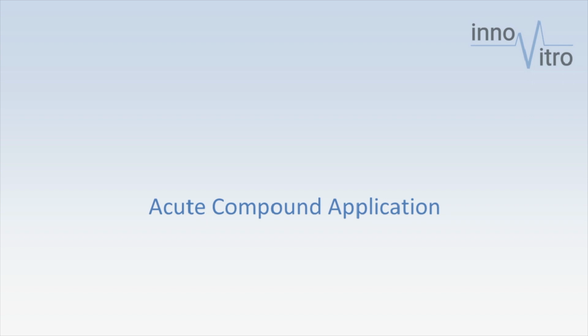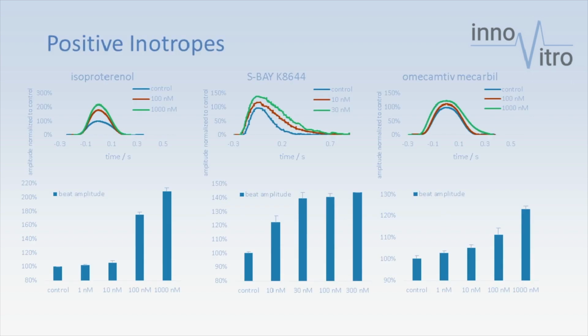So to validate this technology, we measured quite a lot of compounds. I would like to show the basic benchmark compounds that we found out seem to be very important. So for acute compound application, this is obviously positive inotropes, because positive inotropes are not so easy to measure with iPS-derived cardiomyocytes and standard assays.